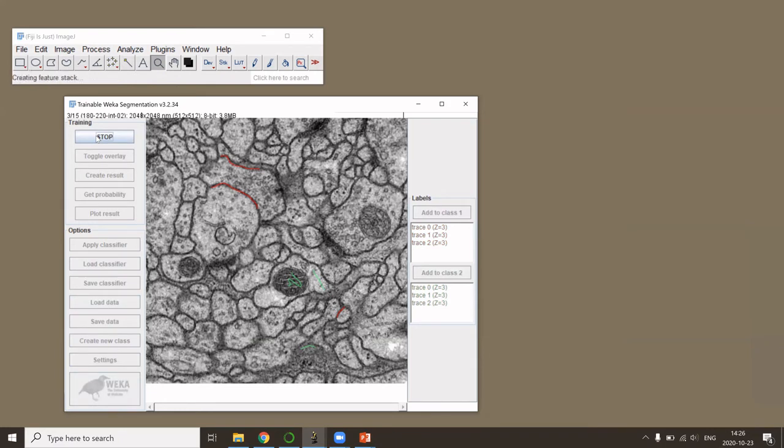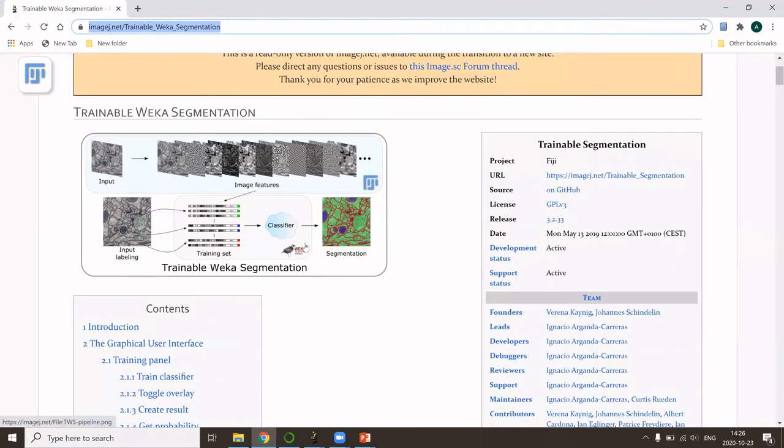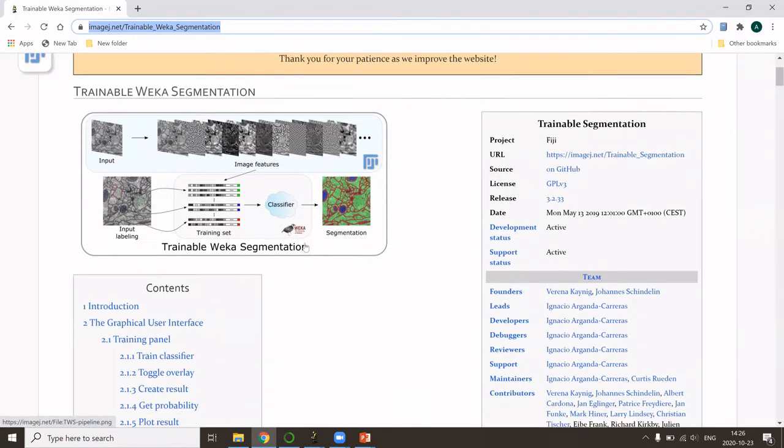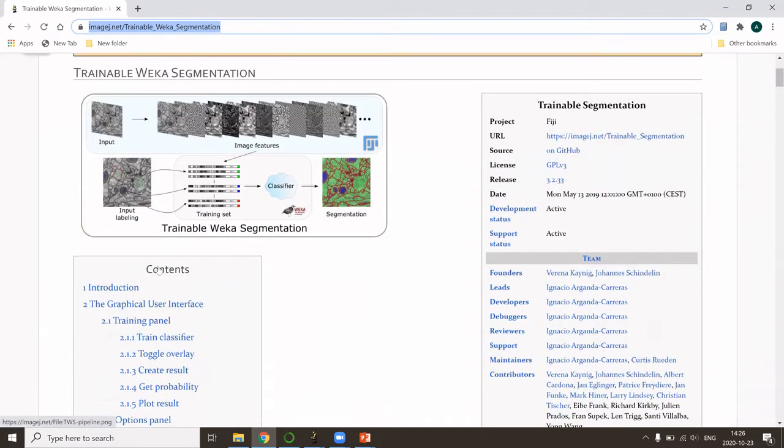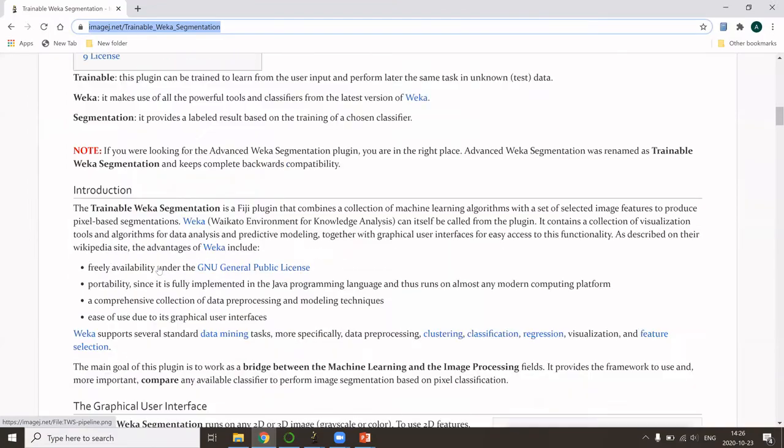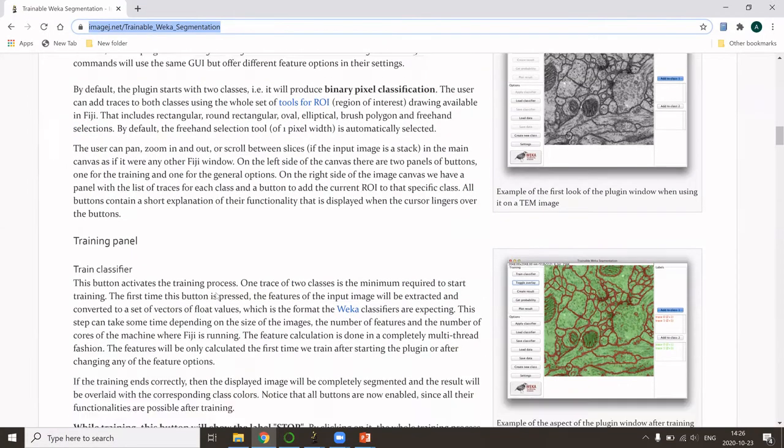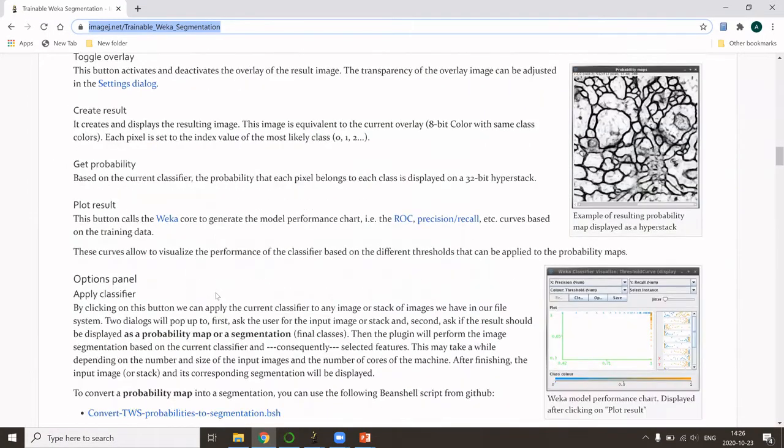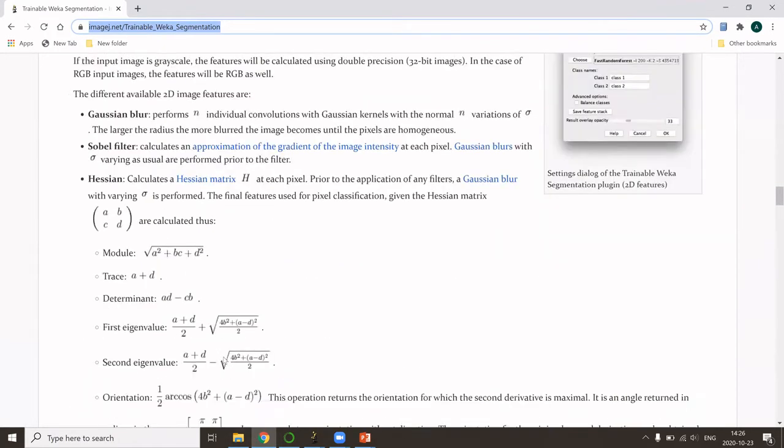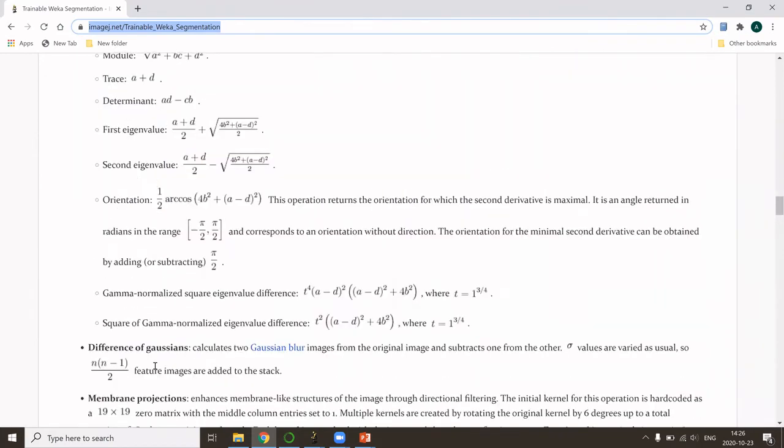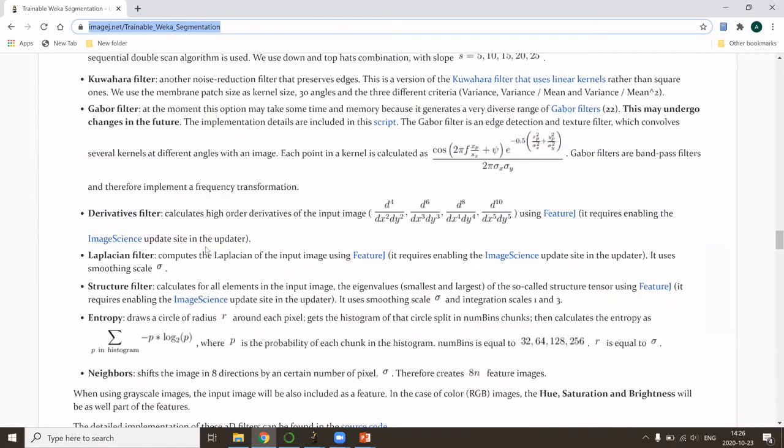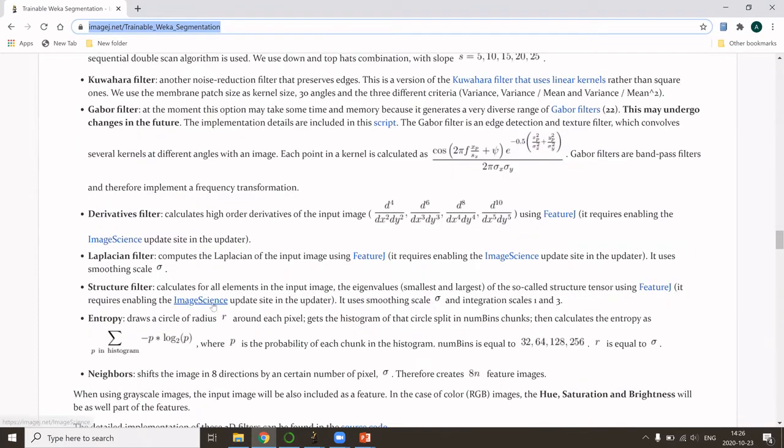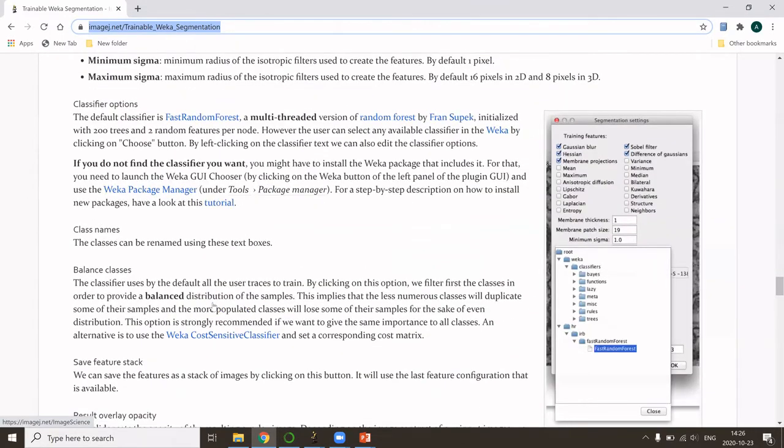This will take a bit. While this is running, I can show you that the plugin is very well documented. Online, when you search for Trainable Weka Segmentation in Fiji, you can find all this documentation. As for all classifiers, of course the core part is filtering your image with different filters. What is very nice here is that you can find documentation on all the filters that are used, so you can really choose which filter is the most appropriate for your images.